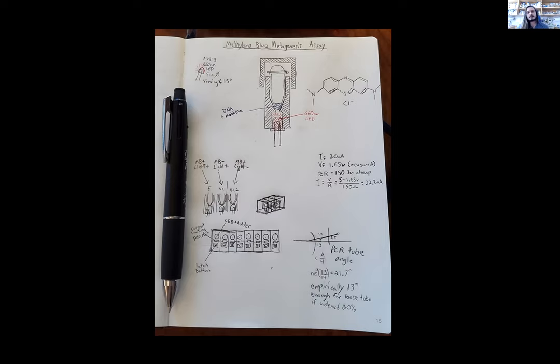And so I decided, all right, let me build something that is super simple. It just holds an LED on one side. It holds a PCR tube with a sample on the other. And then you have cells in there or plasmids. And the methylene blue you can buy like 100 grams for $5 or something. It's absurd. And you don't need much. And so I drafted some stuff on my notebook. I spent way too much time trying to figure out the angle of the PCR tube, because some patents say 13 degrees, some 17. I said, 13, sure, 13 degrees.